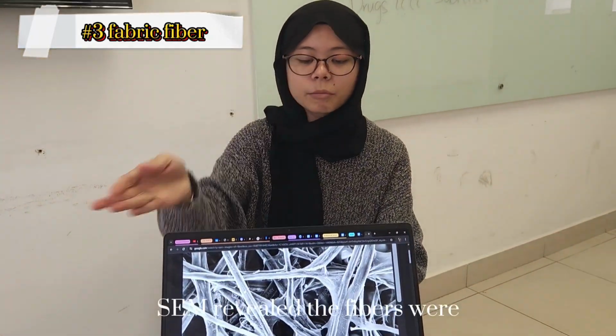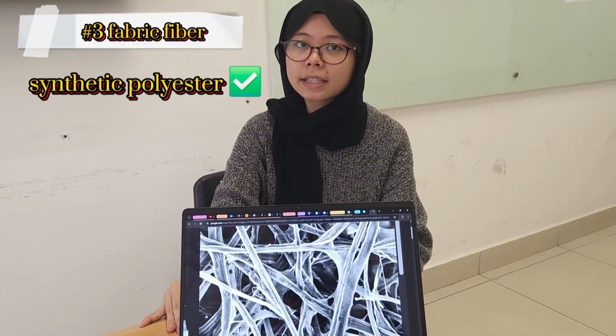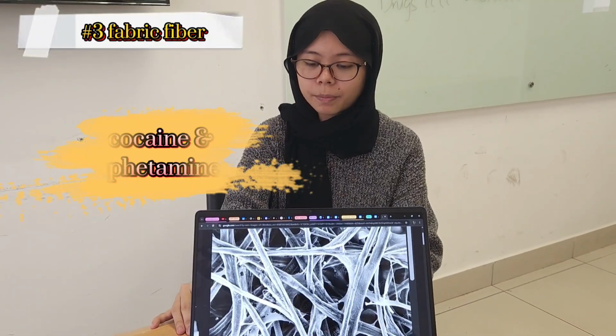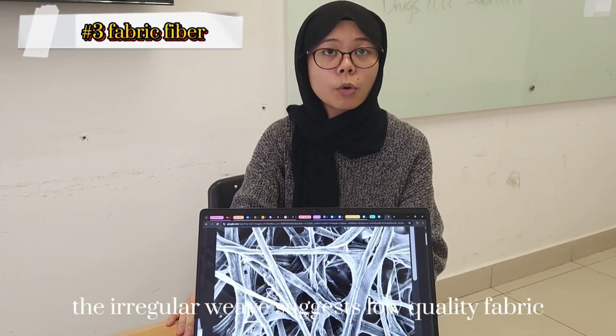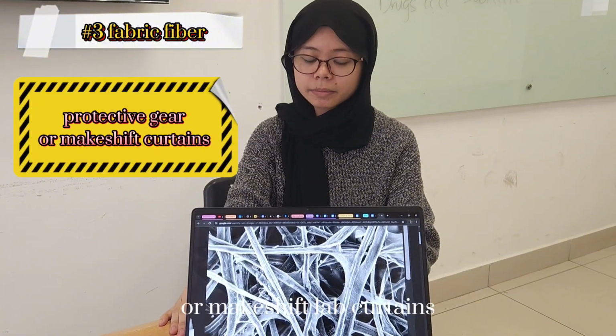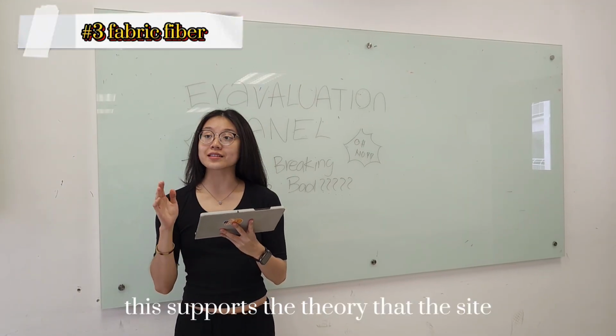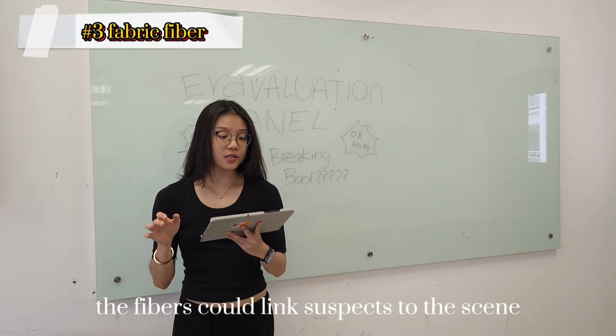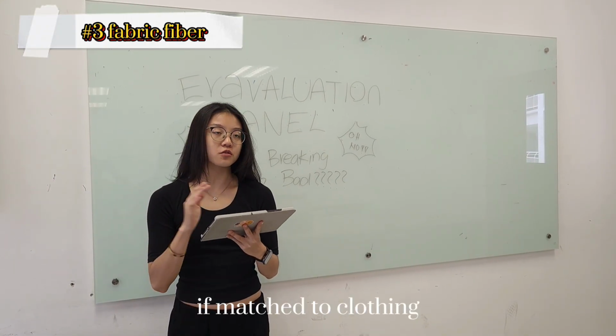The SEM revealed the fibers were indeed synthetic polyester and not natural cotton. Their surface had embedded crystalline particles consistent with cocaine or methamphetamine residue. Their irregular weave suggests low quality fabric, possibly from protective gear or makeshift lab curtains. This supports the theory that the site was used for drug processing. The fibers could link suspects to the scene if matched to clothing.